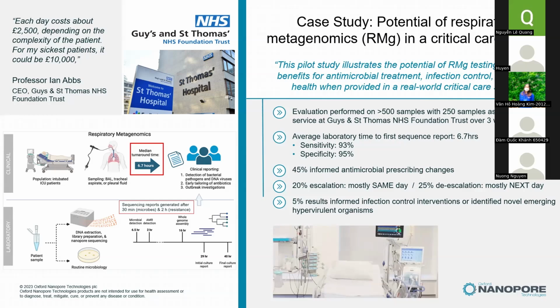In Oxford Nanopore, on our website, there's a section that has extraction protocols. You can search depending on the sample type that you are working on. You can try to search whether there's a collection or past work that has been done and is showing good results with the Nanopore platform, then you can try that particular extraction method to ensure that you get good material to start with.